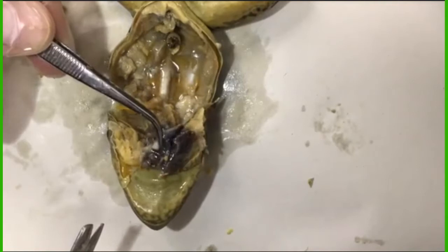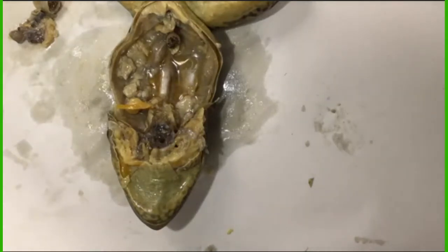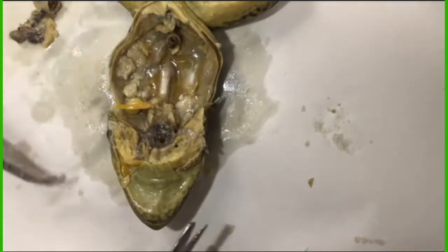So those are the kidneys, the two dark looking organs there. See that white tube looking structure at the back? That is the spine. That's the backbone of that frog. We're all the way at the back of that frog. That's where the kidneys sit, right on top of that spine.